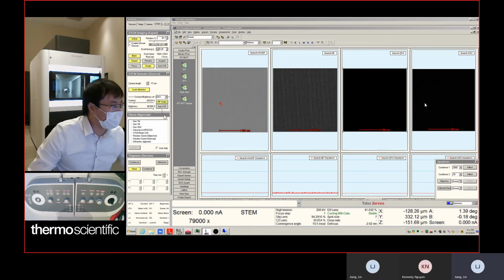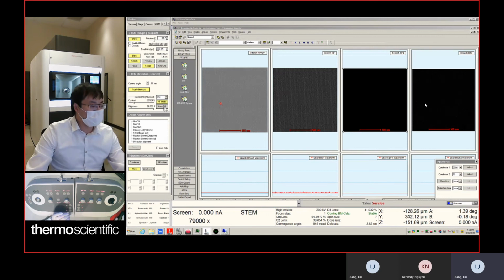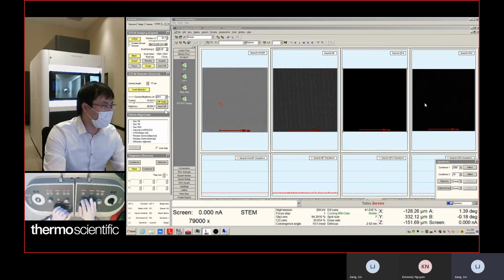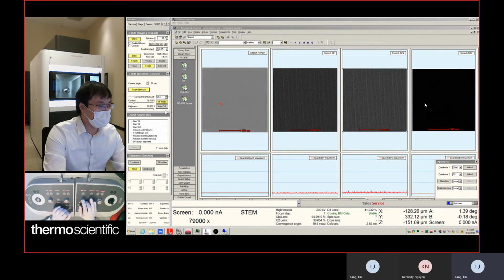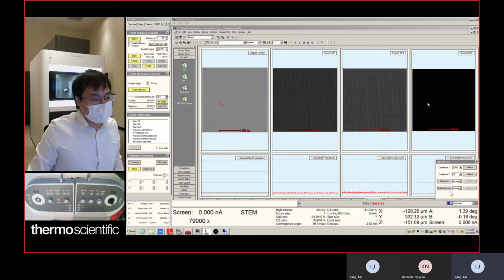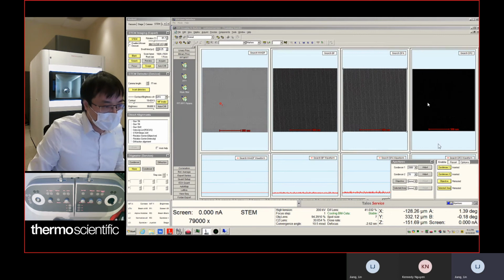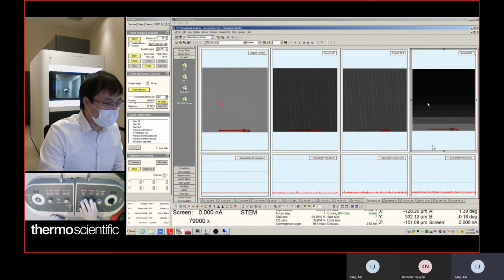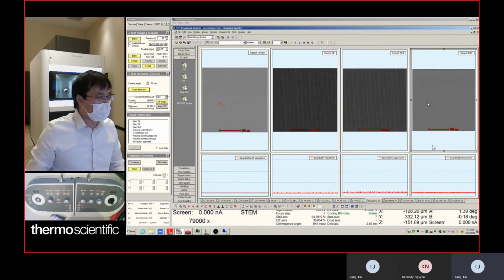Let's use the multifunction. When you choose the multifunction knob, you can use multifunction X and Y to adjust either contrast or brightness, with multifunction Y related to the brightness. So you can use the multifunction Y to adjust the brightness to make sure this bottom red line is just above the blue line. And then we can select the F2 as well. So we use multifunction Y to adjust brightness to make sure it's just above the blue line.